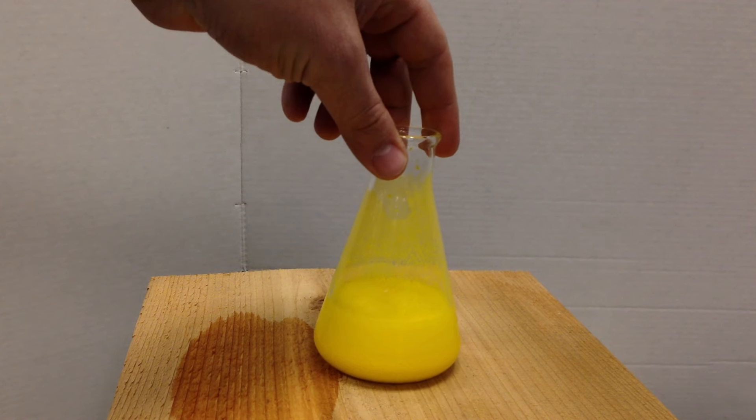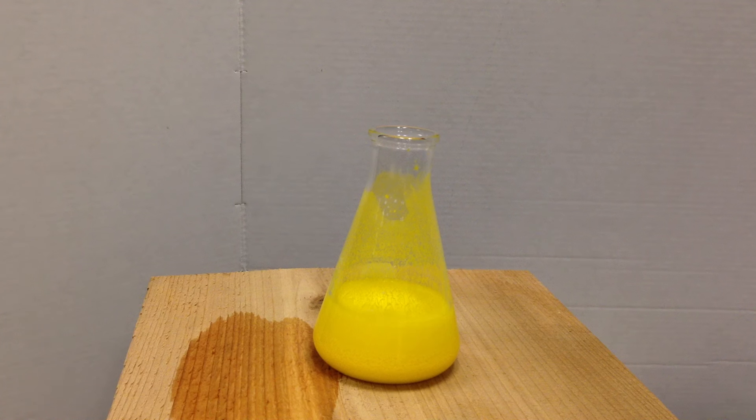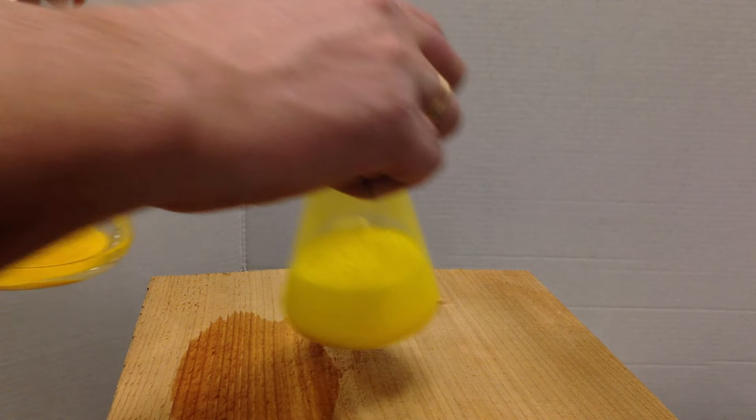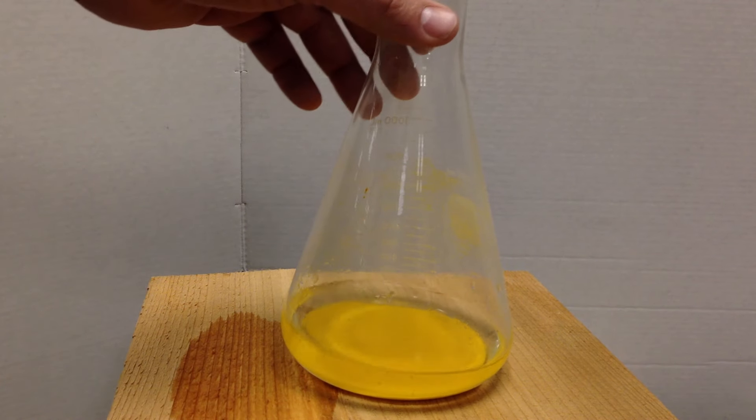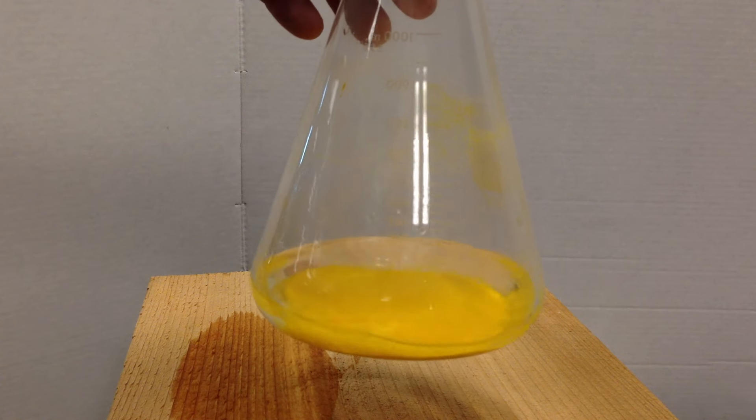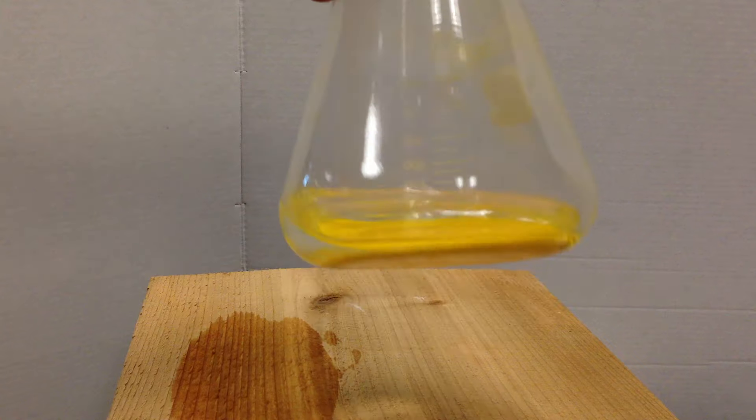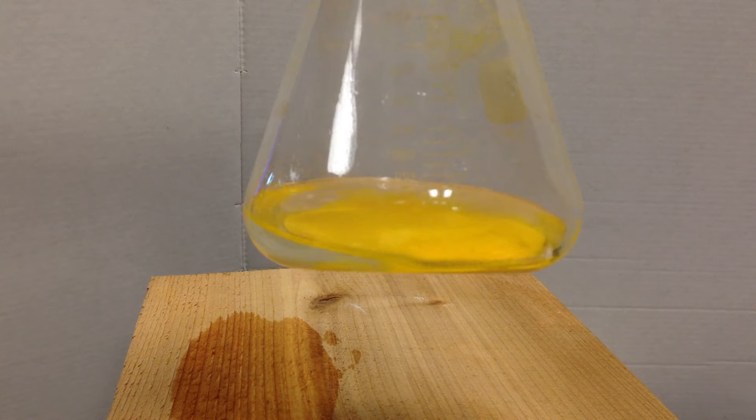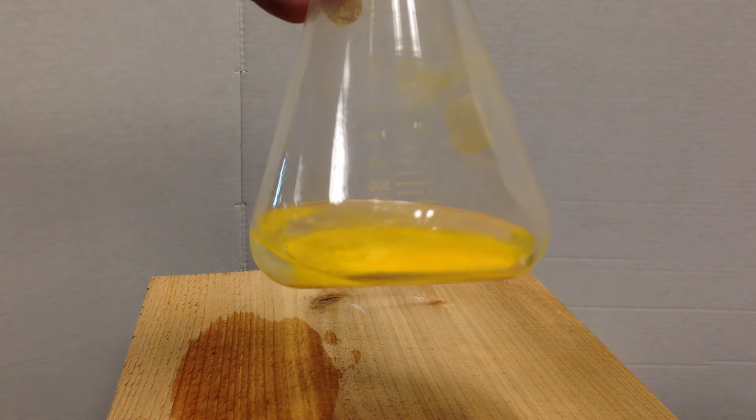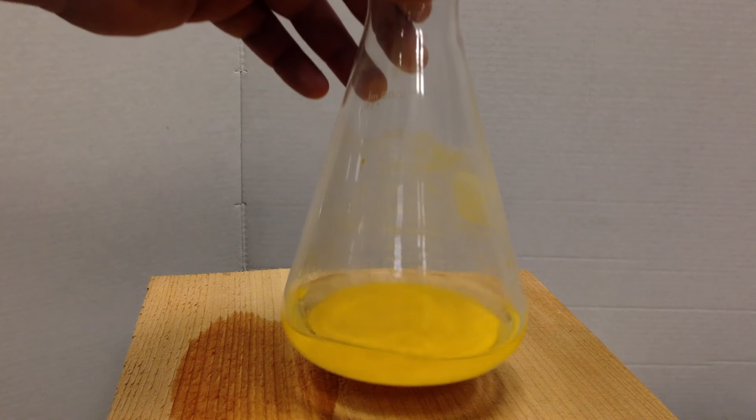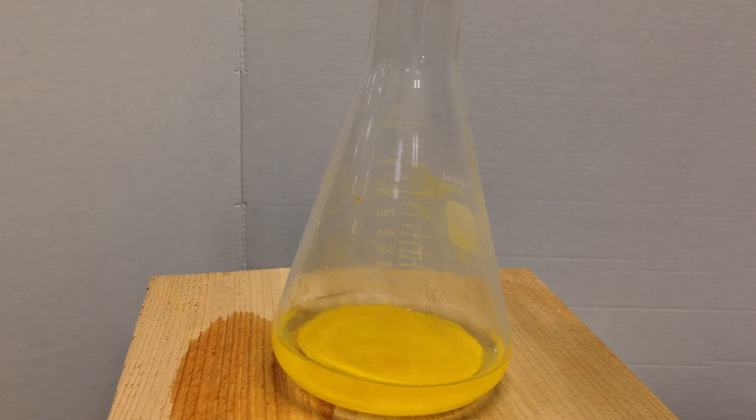And if we let this settle for a while we'll get something like this. This is a reaction I did about an hour or so ago and you can see here that the clear solution is the potassium nitrate ions or the potassium and nitrate ions and the solids are at the bottom. That's settled at the bottom. So there is your precipitating reaction.